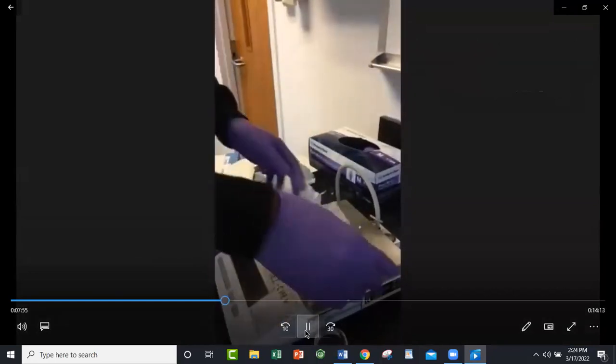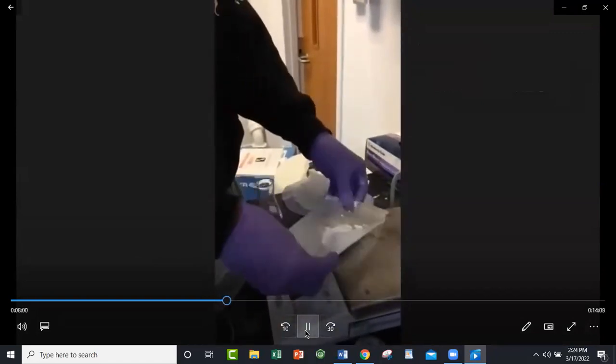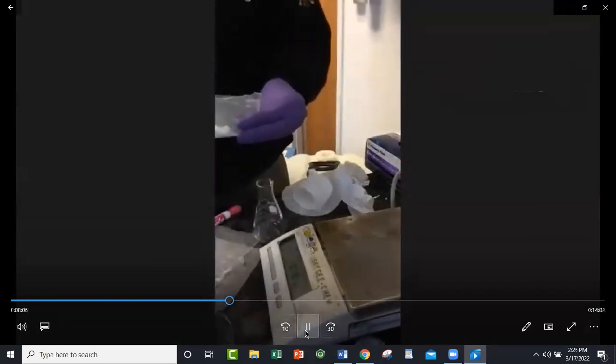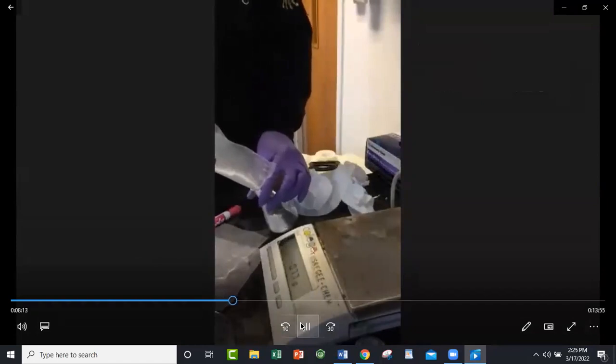So I'm just going to take this and transfer it into this Erlenmeyer flask. The reason I have to do it like this is because we didn't weigh the filter paper. Otherwise, we could have just tared the scale to zero and reweighed the filter paper plus the aspirin.